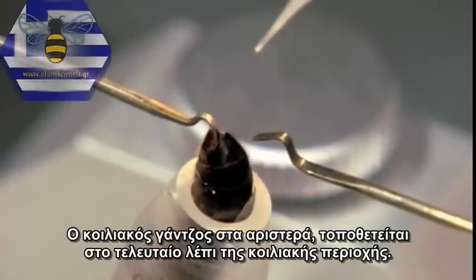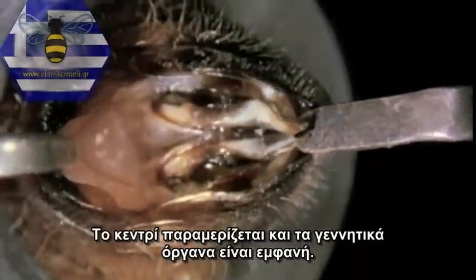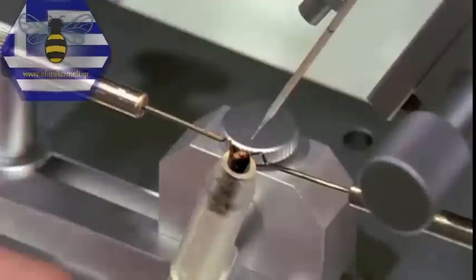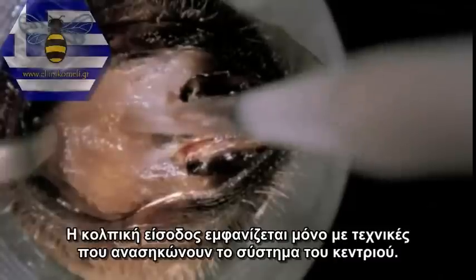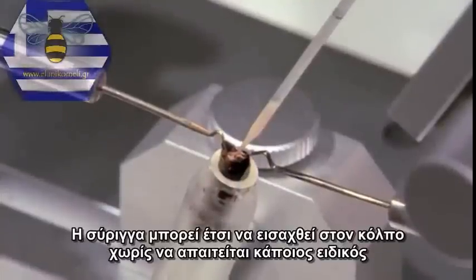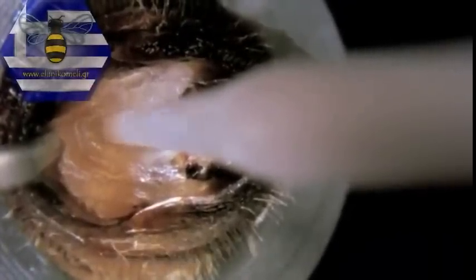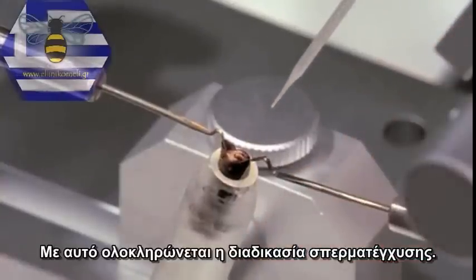The ventral hook engages behind the ventral plate of the last segment. The dorsal or sting hook — in this case a perforated hook — exposes the sting chamber; the sting lancets and epidermal folds are now visible. The vaginal orifice is recognisable as a wrinkled bulge in the middle. The syringe is adjusted in the direction of the vaginal bulge and the droplet of diluent removed. The vaginal orifice is only exposed in techniques which lift up the sting apparatus, so the syringe can be inserted without the use of a vaginal probe and the semen is injected directly.